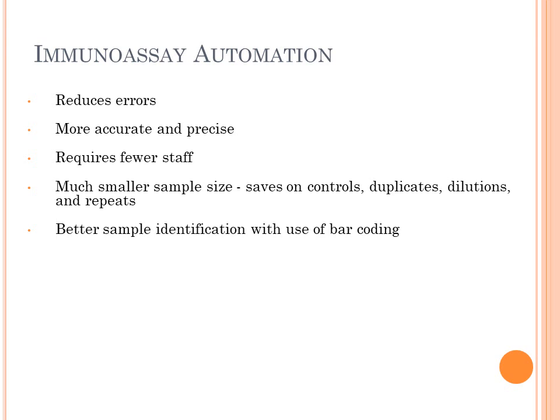Often the modern instruments have barcoding, so that a barcode is on the patient specimen that is automatically read by the computer with the analyzer. Again, eliminates potential human error, speeds the entire process up.